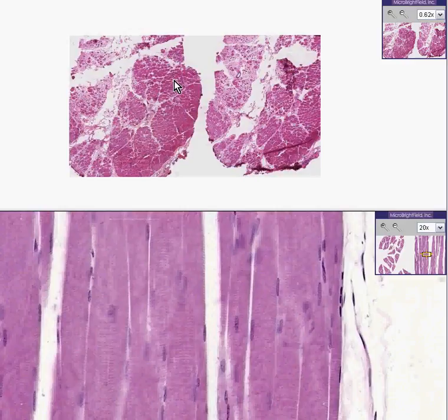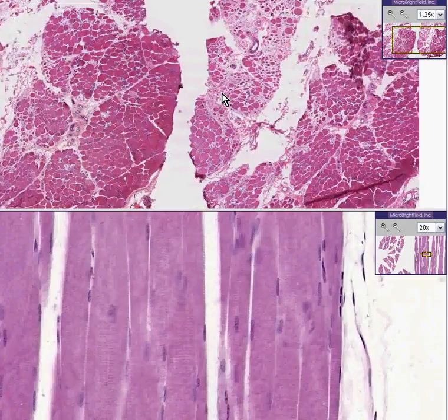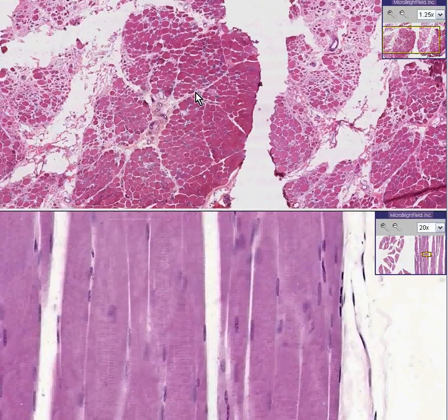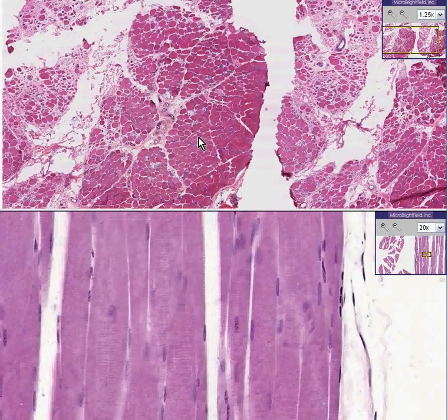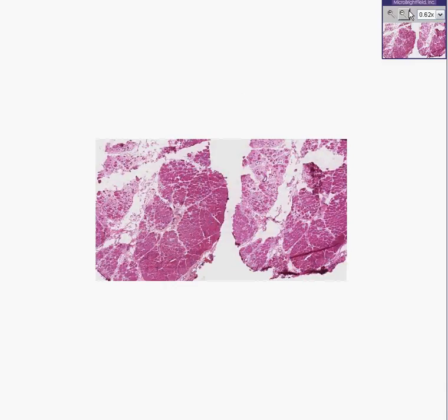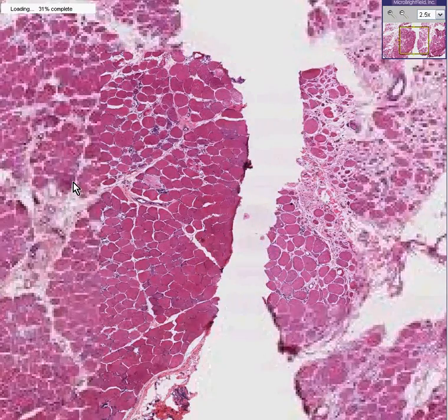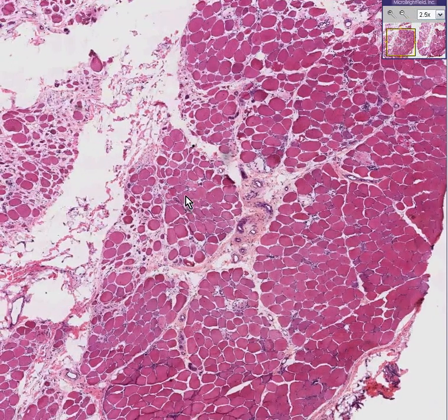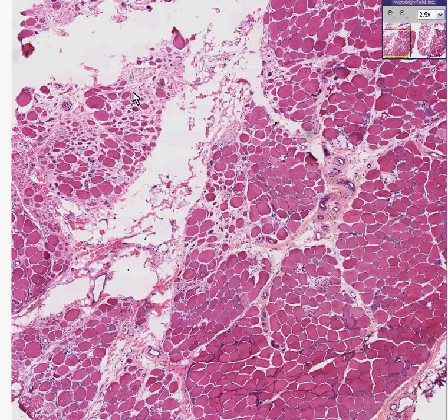Here is muscular dystrophy on the top. Even from this half-of-a-screen view, you can see there is an area where it kind of looks normal, but an area where there's a lot of extremely small fibers and more fibrous tissue than usual. Here is the skeletal muscle biopsy of somebody with muscular dystrophy. This is not particularly advanced, but you would guess that an area like this would be more advanced than an area like this.